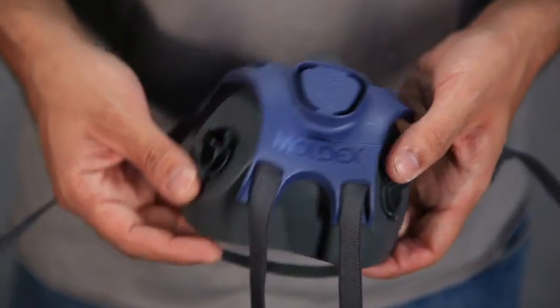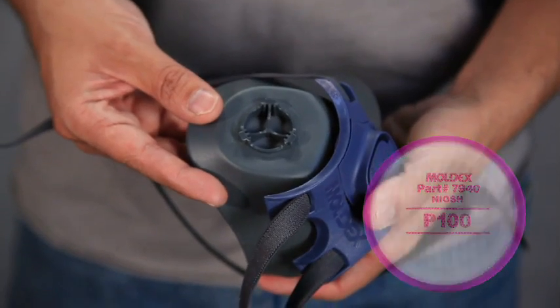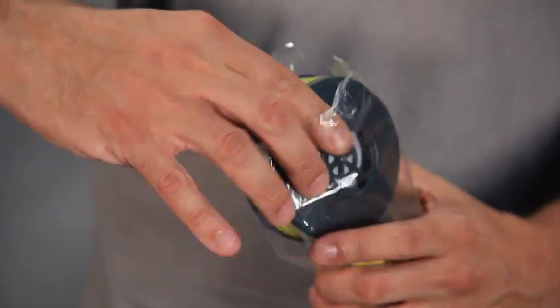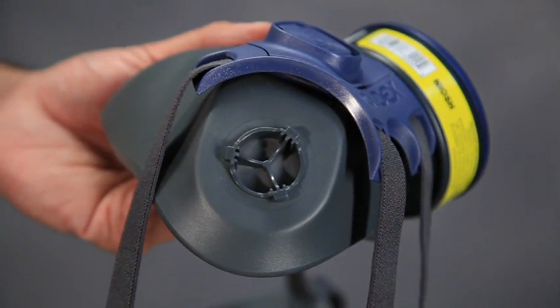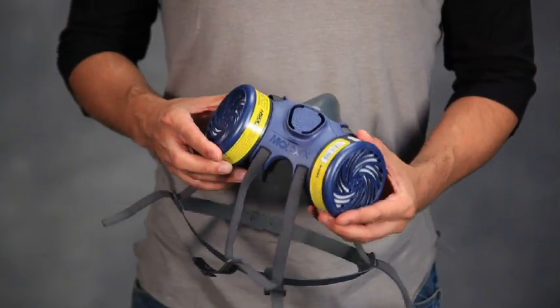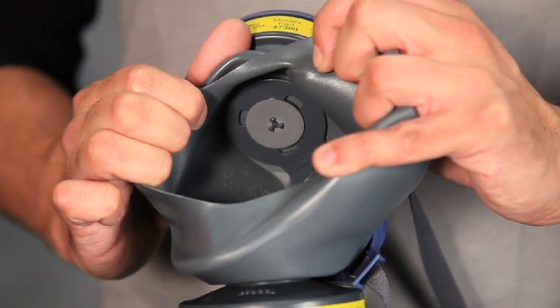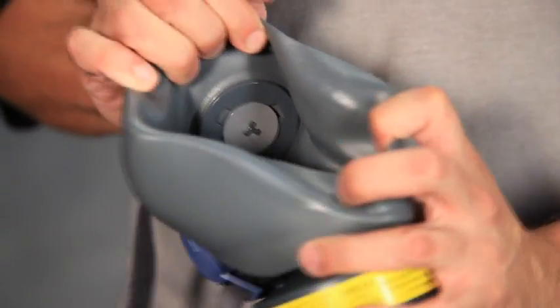Inspect the face piece to cartridge or filter disc sealing surfaces to make sure they are clean and undamaged. Only use cartridges or filters from sealed bags. To attach, align the three notches with the three bayonets protruding from the face piece and firmly turn clockwise until locked into position and unable to turn any further. Check to see that it is seated and flush against the face piece. Then check the inhalation diaphragms for dirt and or damage and to verify that they are seated properly.